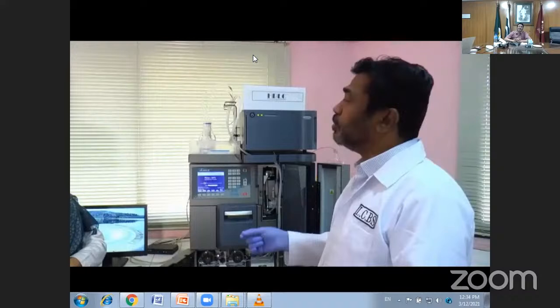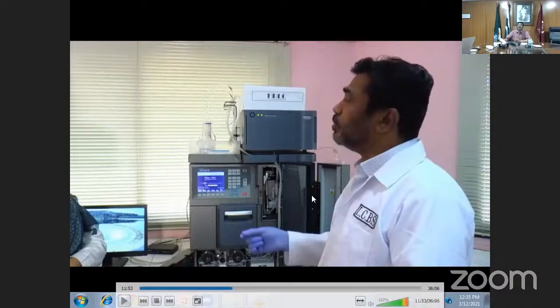You have an integrator. So, if this kind of hardware is available, then we can start our analysis or quantification of the unknown substance or known substance. Unknown substance again requires some standards.